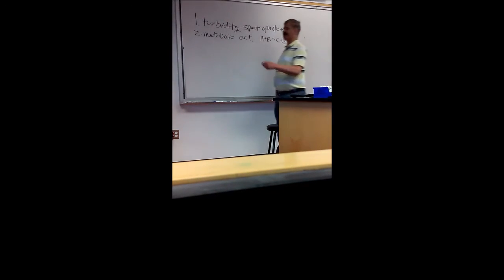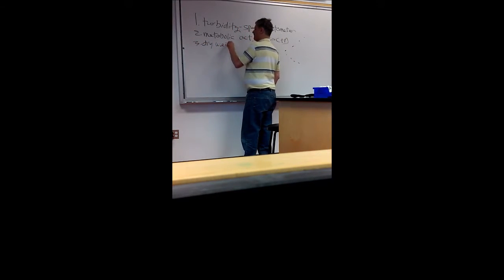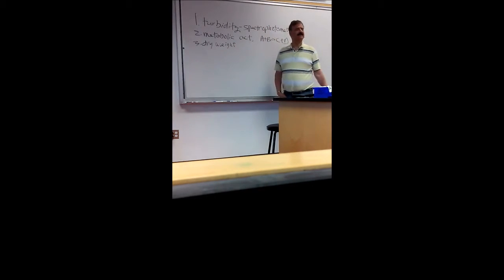Third one, dry weight. This actually is my least favorite. When I was still doing research, I could never make it work. You know, a lot of other guys could. I just couldn't. What it is, you take out a sample every few minutes or whatever. So once again, every few time units. Take out a sample, but this time you take out the water. You do that by applying a suction to it over filter paper. You apply a suction to it, you suck out the water, and then you simply weigh whatever's left.